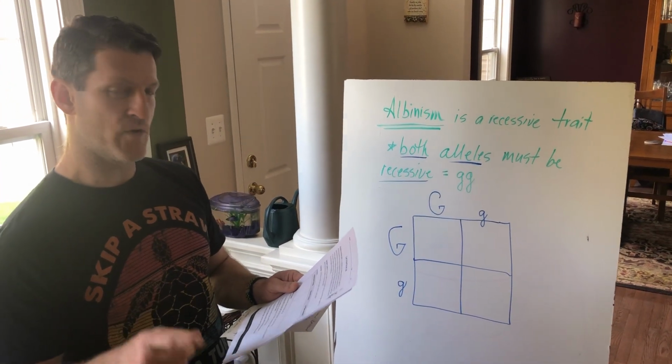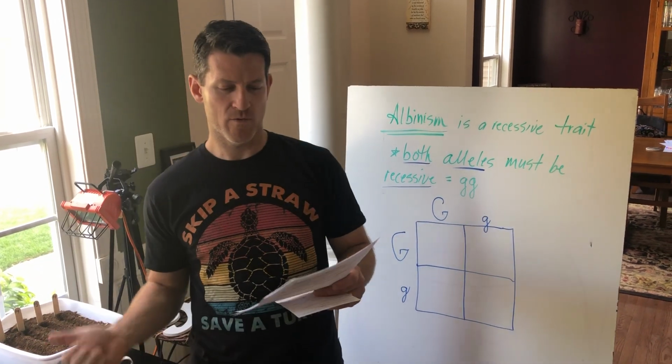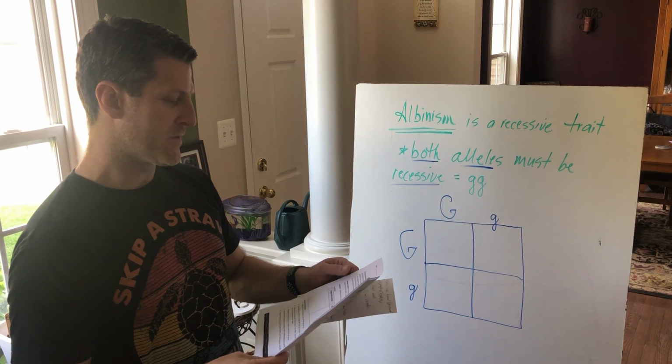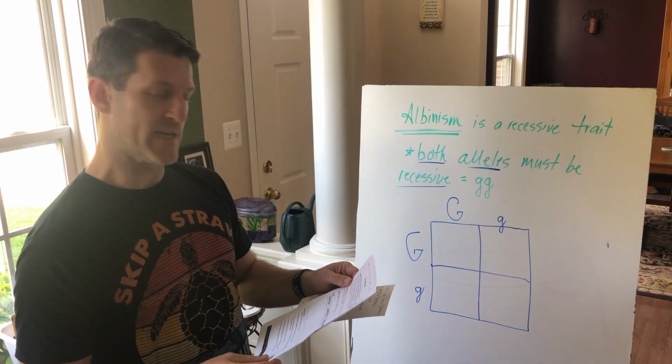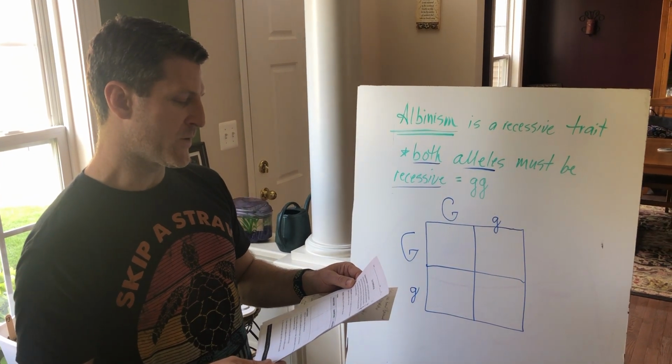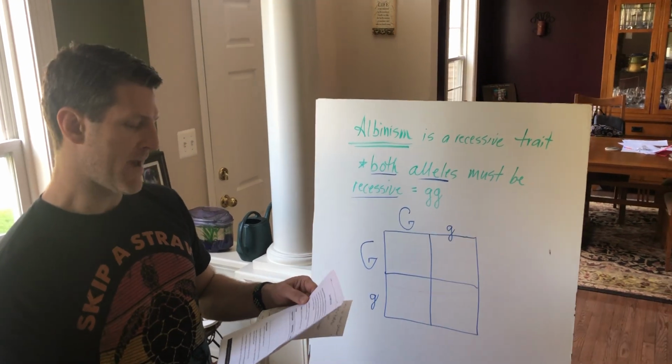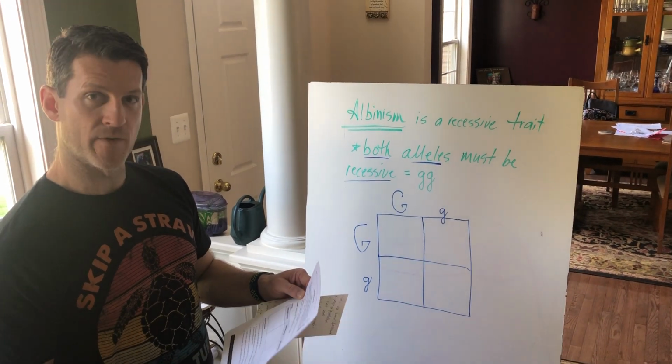After the seeds sprout, you guys are going to observe. I'll post another video or picture as they start to sprout for you guys to see what's happening with the seeds. And we'll have a chart where we can keep track of that. So your testable question is, how does a plant use chlorophyll, as well as what do you think might happen to a plant that lacks the ability to make chlorophyll?